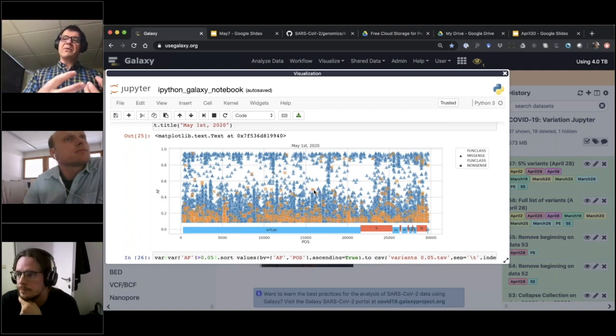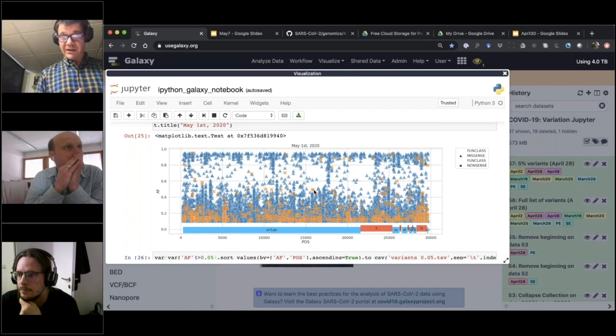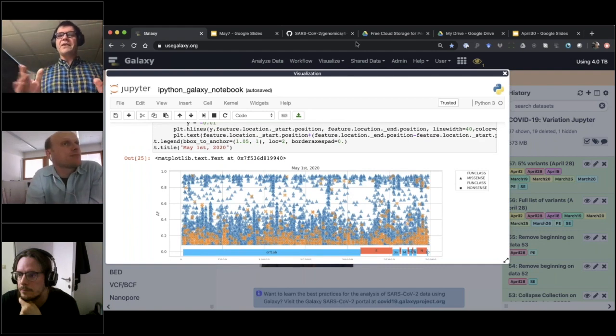And this is something we're going to have in subsequent seminars where we combine this information with information about sites under positive selection and try to make predictions of where the virus is going and what these sites can potentially do. But the important thing, what this webinar was about, one, you can use Galaxy to run analysis of this sort yourself, but you can also use the data we have produced.